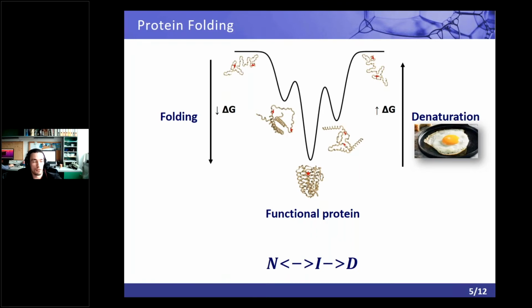So typically N stands for a native state. So this is a functionally folded protein, that is at the bottom. Then we have an intermediate state that might be this state on the left or on the right. And then you have a denatured state that can represent something at the top, for instance. So then it's a lower resolution description of this folding or unfolding of proteins, because now we have, in this scheme, 3 distinct states, and then we can already measure the rates of transition between different states, which states are more energetically favorable or less energetically favorable, or what happens if you introduce a mutation, what happens to this mechanism just in this very low resolution of macrostates.